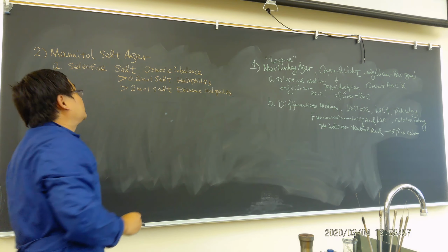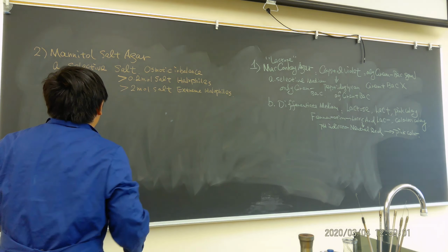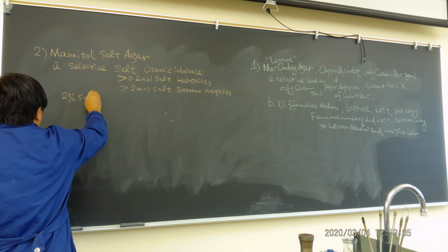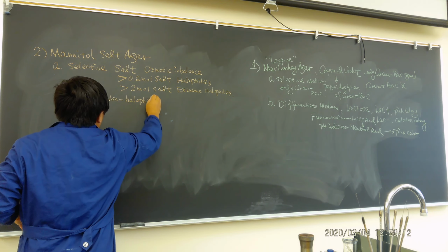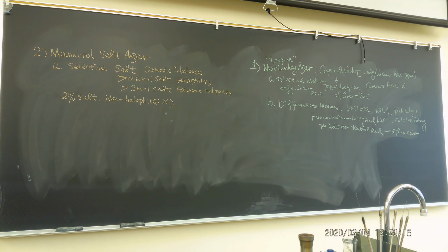But most of the bacteria do not like salt, they will be dying. Okay, so in this medium, they have 2% salt. So now, non-halophiles will die, and only halophiles will survive.